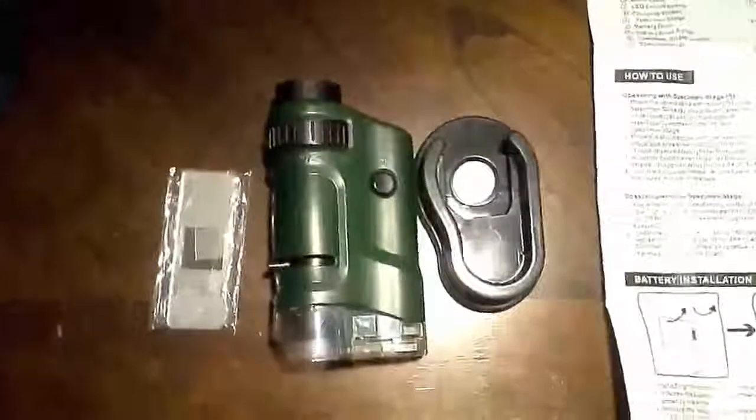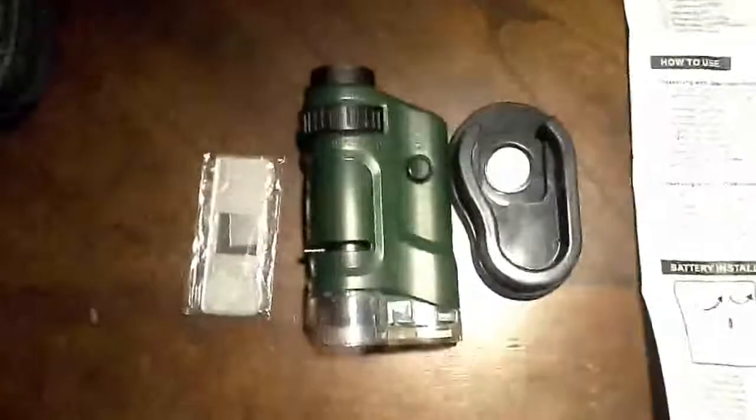Hey, Steve Taylor here, giving you a quick look at the Carson Microbrite. It is a little microscope, handheld, as you can see by the size of my hand. It's not real large. It is plastic. It is toy-like because it is really a toy. But to my surprise, it actually works pretty well.